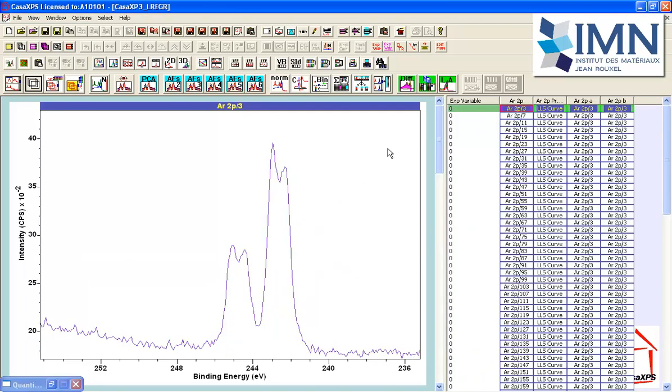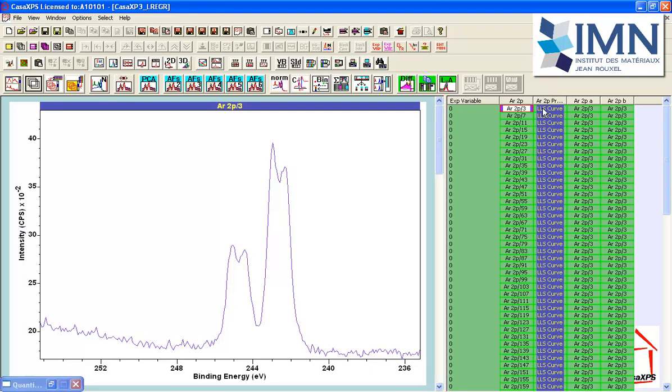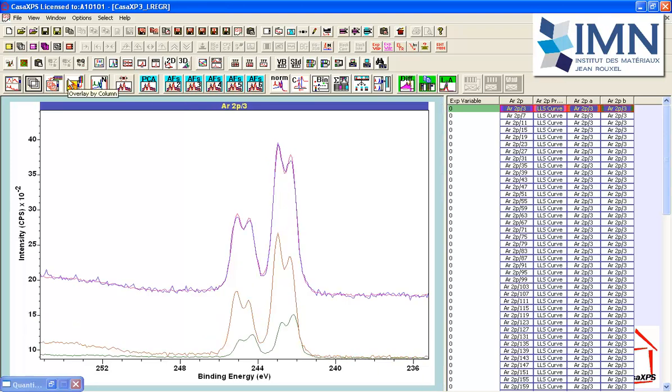And this creates a new data file in which the original data is copied in, a column representing the least square solution, which is the sum of these two other columns that have been scaled in a way to allow the least squares solution to fit the data in each one of these rows. So when I overlay a row, we see a fit of the spectral shapes that I've calculated to the data.